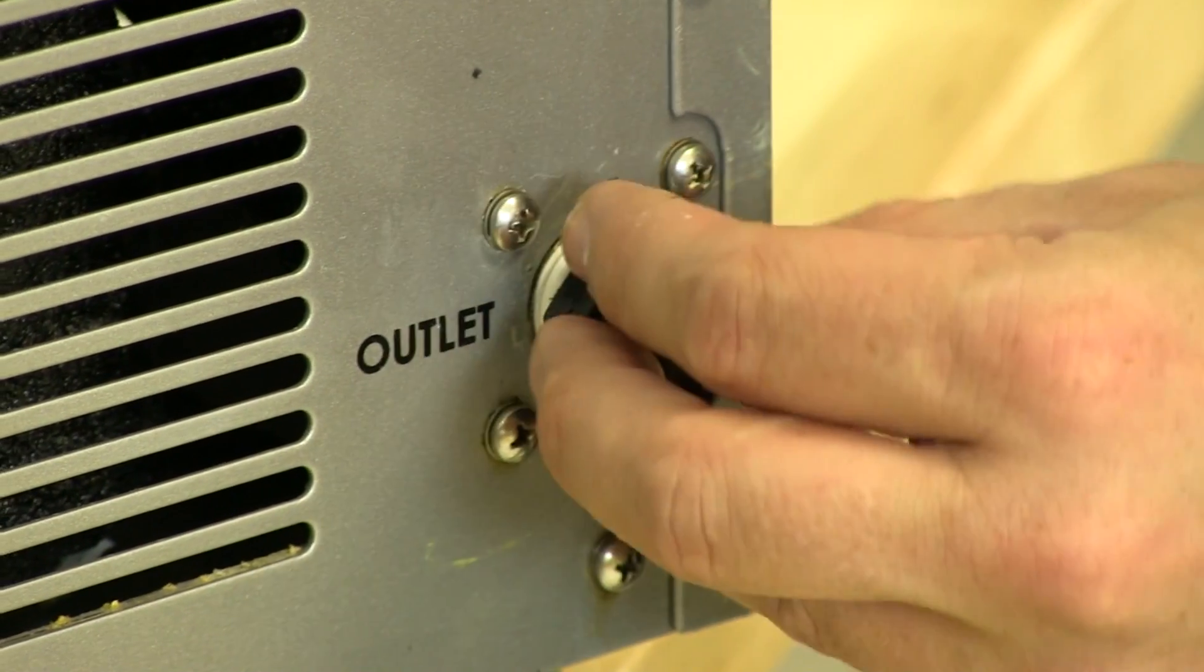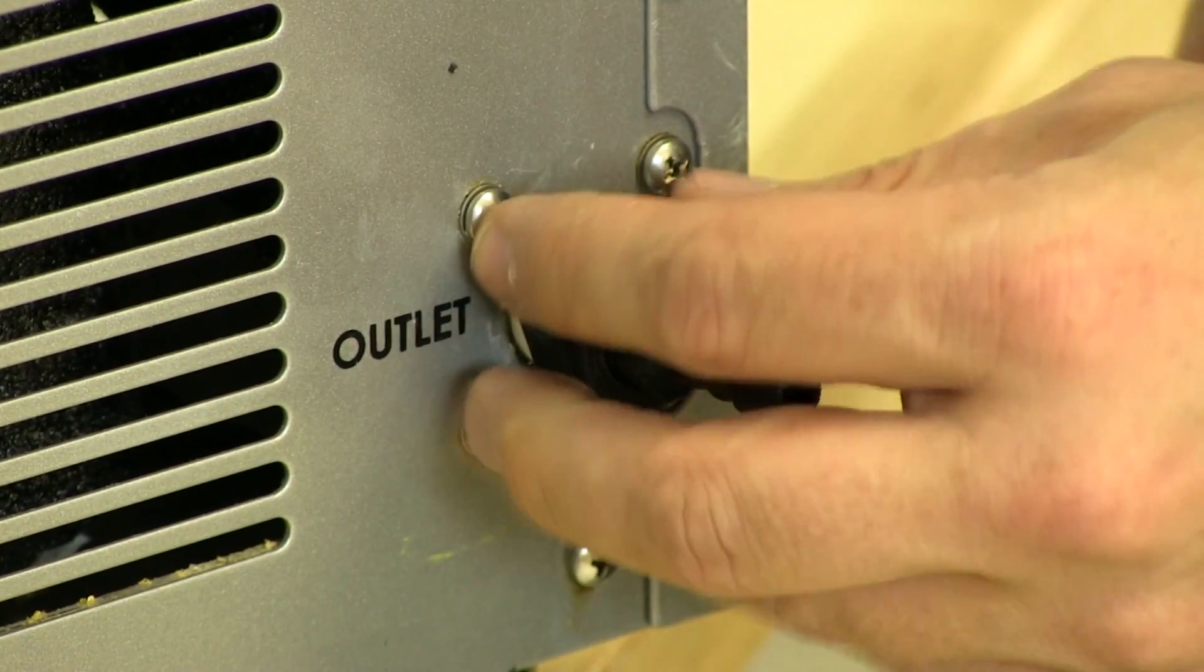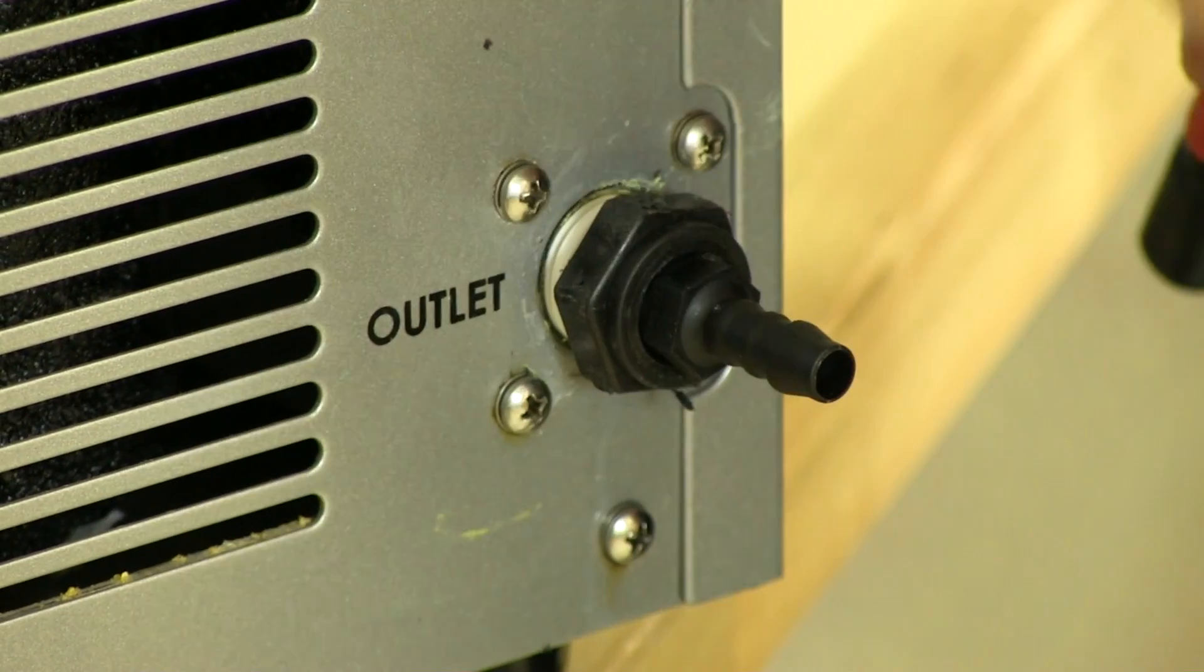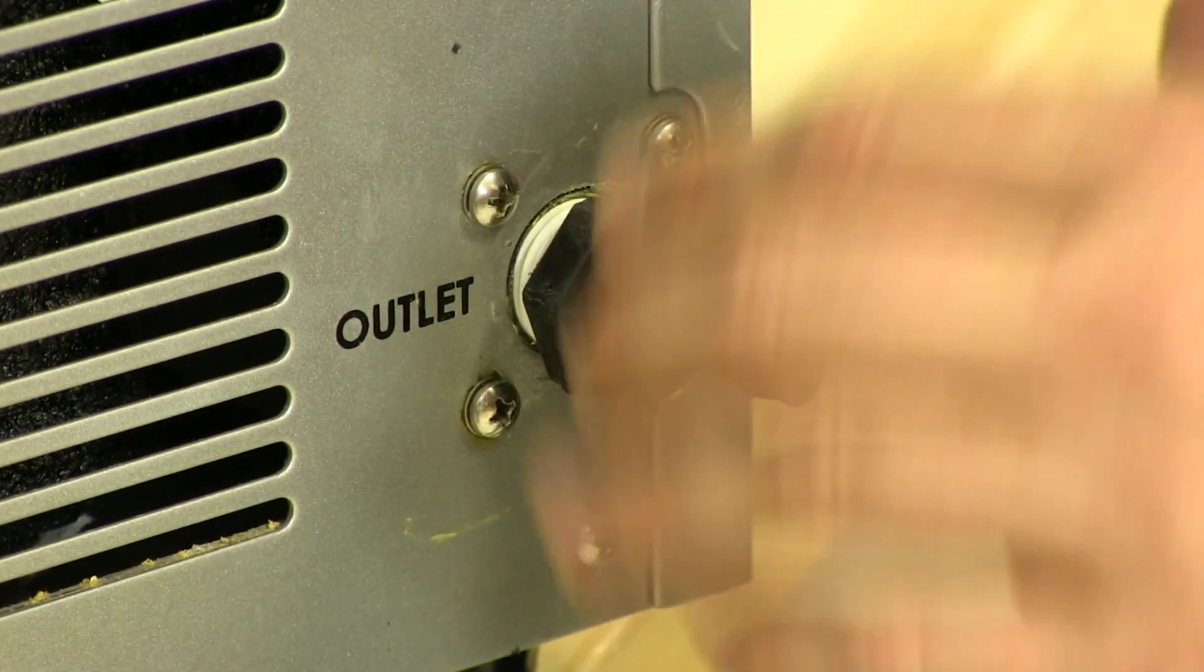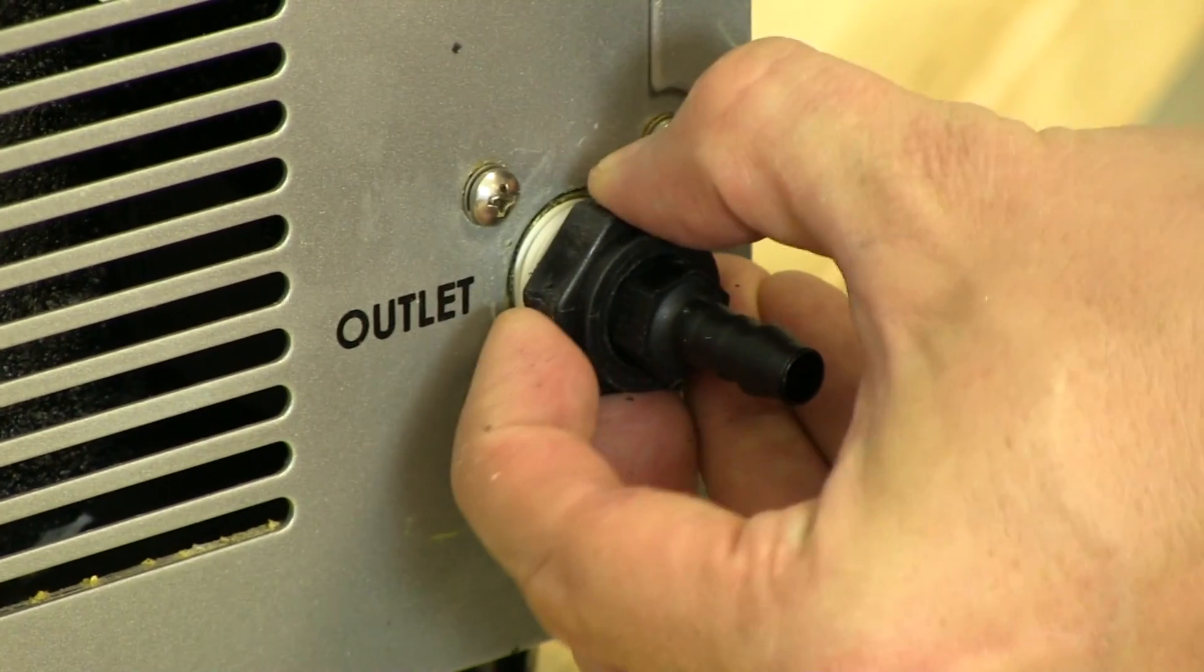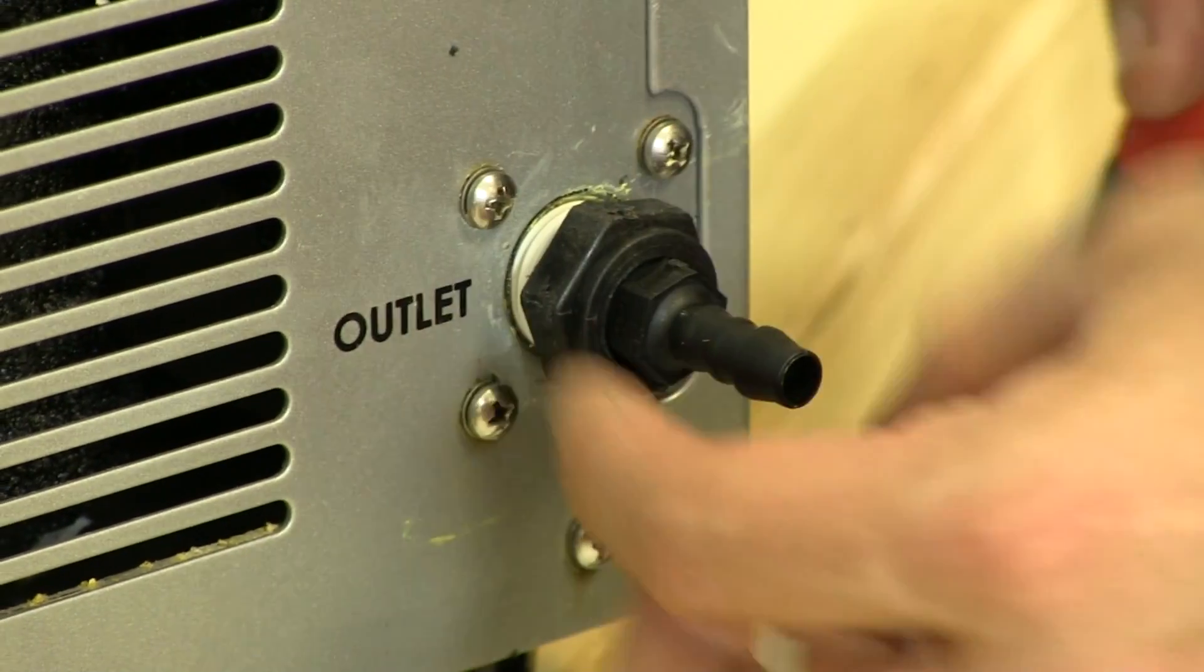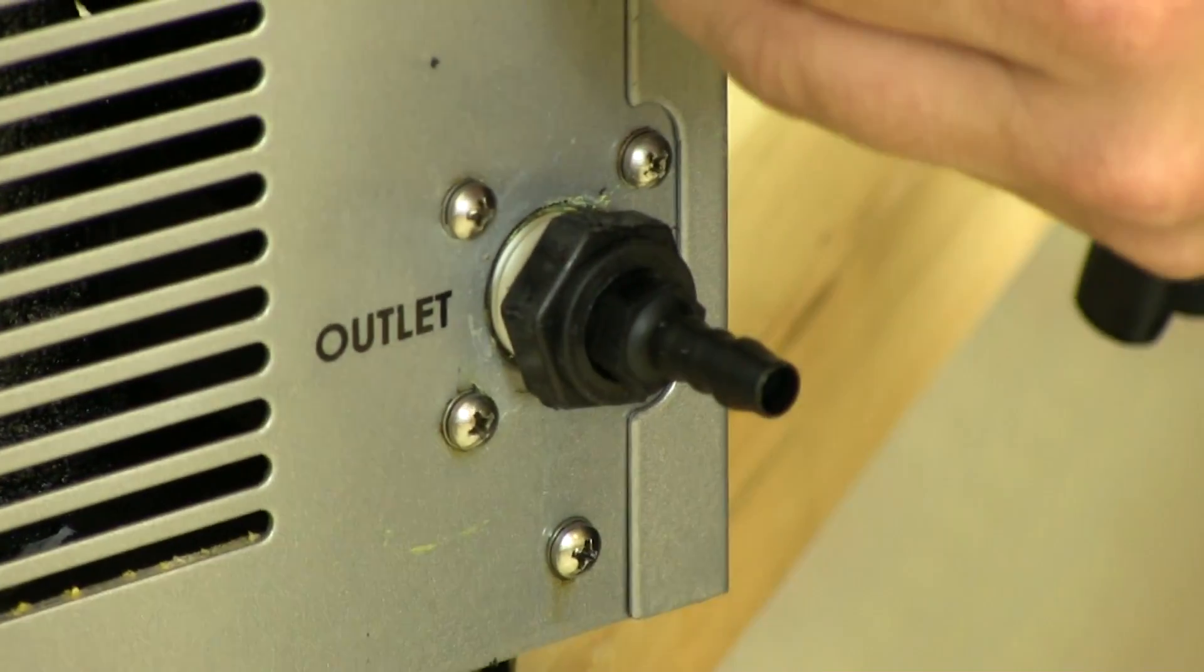The Teflon tape definitely helps in this process. We can always check for leaks later after we fill it and have it running for a moment or two, and if we need to, we can tighten it. It doesn't have to be extremely tight though, it just has to be a nice seal.